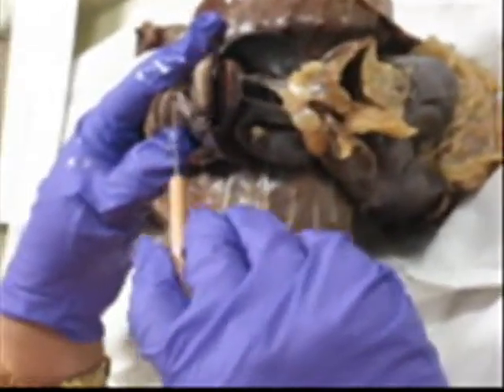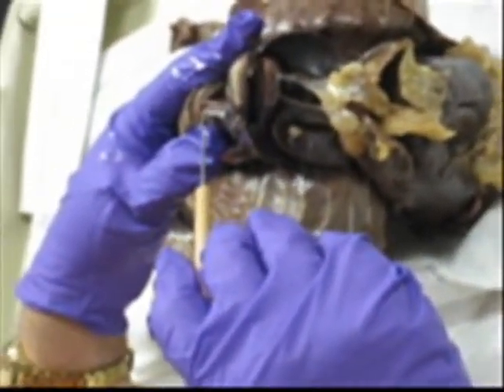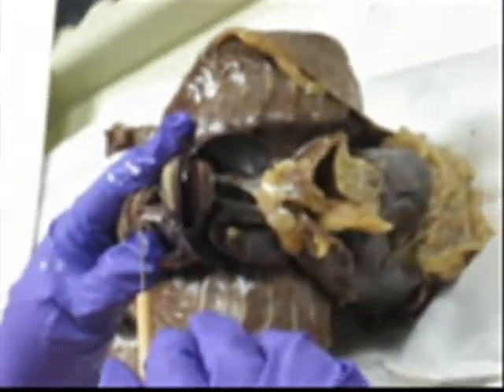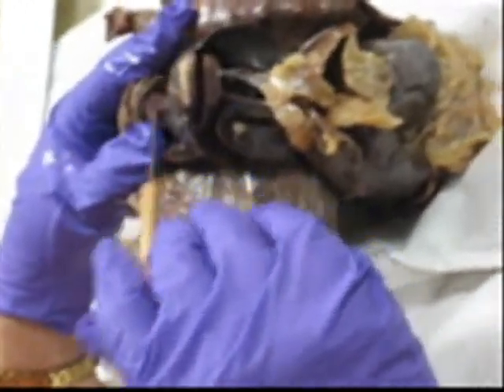The gland above the heart is the thymus — not the thyroid — thymus, T-H-Y-M-U-S. This gland is important in fighting disease; it's immunological.